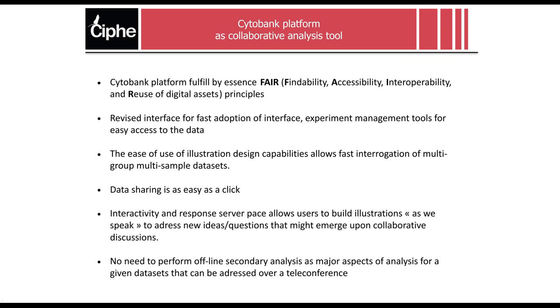You can share data very quickly with a click, and as I mentioned, you can really do this interactivity, this change of illustration, and so on, over TC. Because the server response pace is quite good, it does not take long for illustrations to be updated.